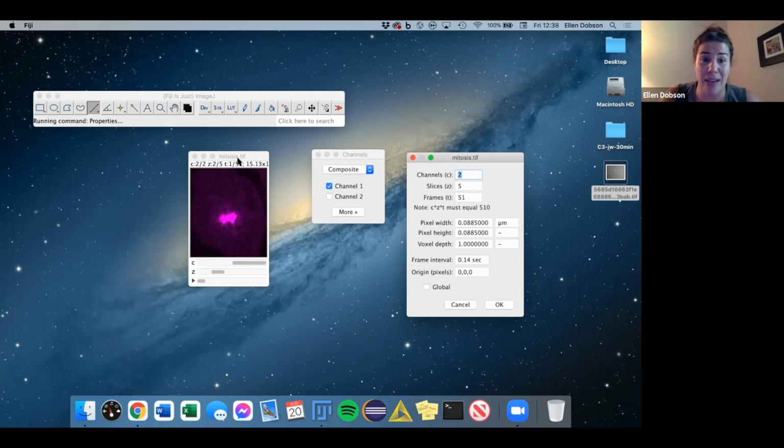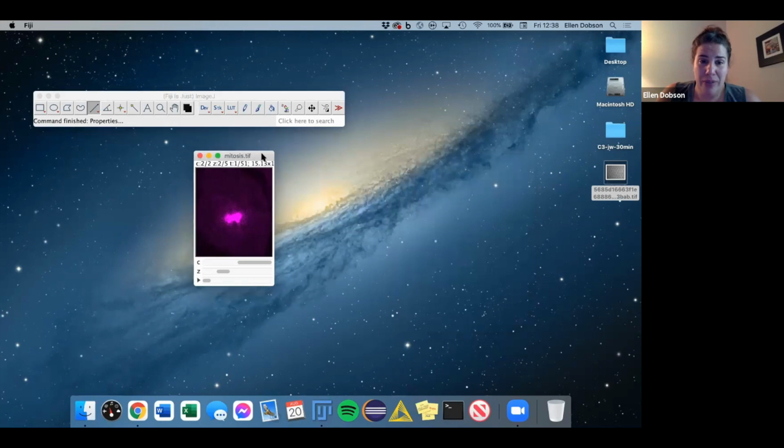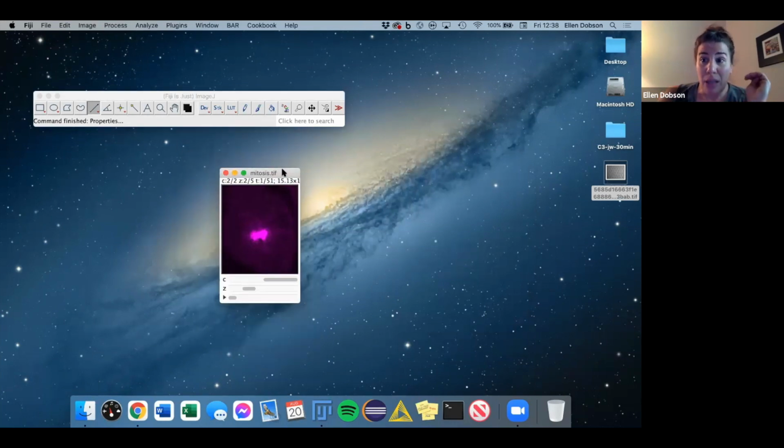So again, this 2D visualization tool is built in with ImageJ, part of the original ImageJ. So it's limited to five dimensions: X, Y, channel, Z, and time. That's the most dimensionality an image the original ImageJ can open. But there are other tools now, available through Fiji, where you can look at images with arbitrary dimensions.